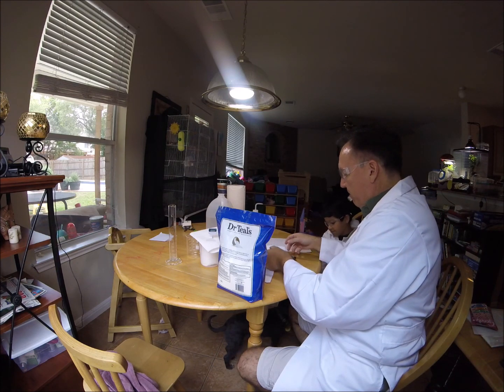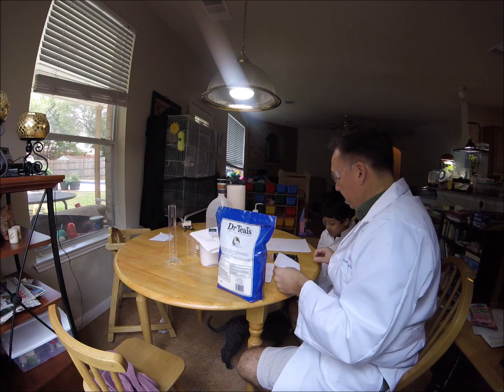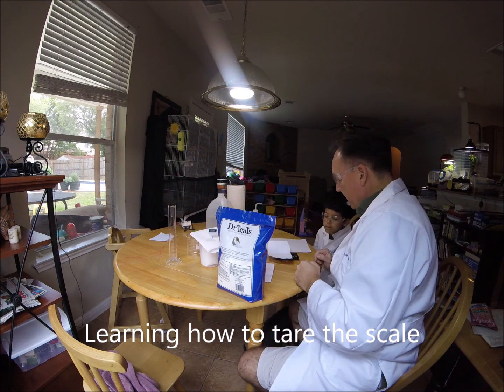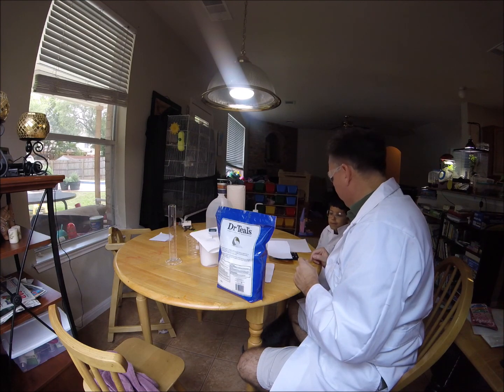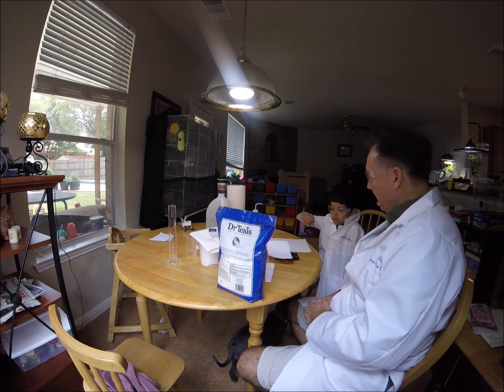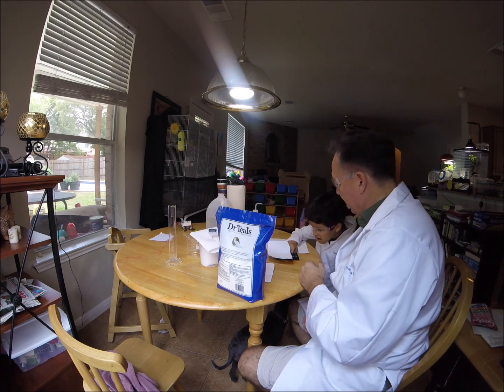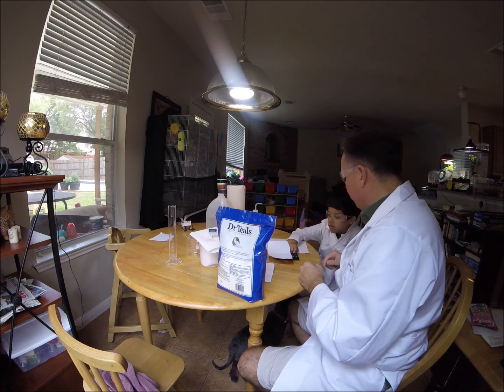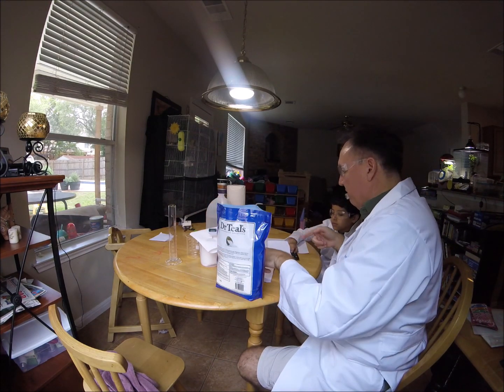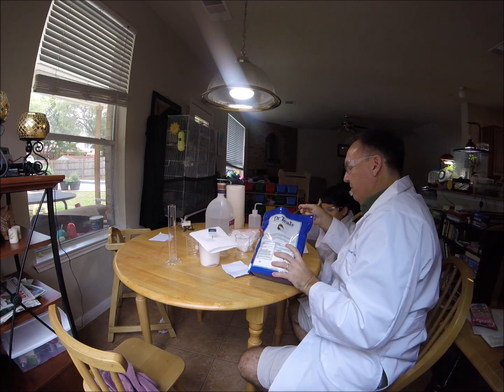We're going to measure it on this paper here. We're going to weigh it out. Now look, I want to show you something — this is where you need to pay attention. The scale says zero. If I put this piece of paper on there, now it says 1.087 grams. So you see that T button? That stands for tare. I want you to tare the scale and tell me what it says afterward. Zero — 0.000. What you just did was adjust the scale to compensate for the weight of that paper. That's called tearing.